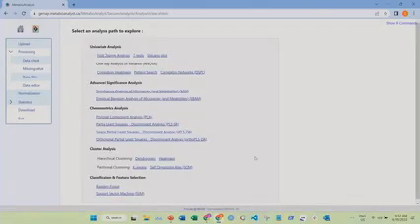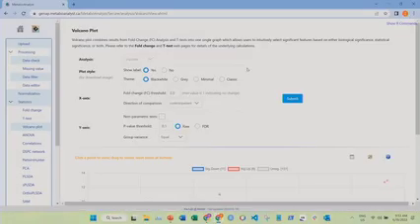So next, this is the overview of all the different statistical methods. I'm not going to go over them in detail, but at the top here, we have this univariate analysis that we talked about. The two main ones are the t-test, ANOVA, and volcano plot. So t-test is going to be available if we have only 2 groups in our data. ANOVA is going to be available if we have more than 2 groups. I personally like the volcano plot.